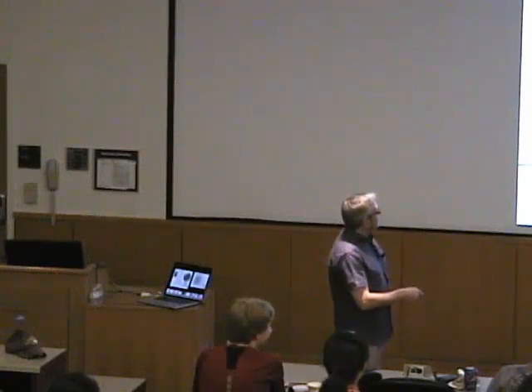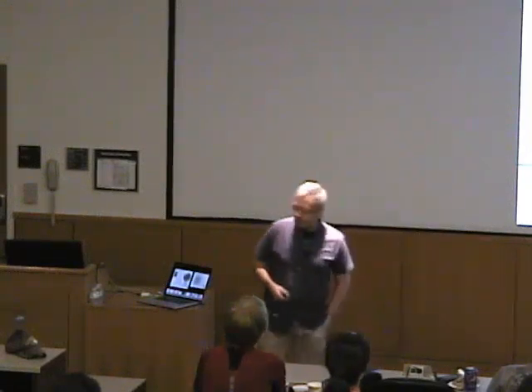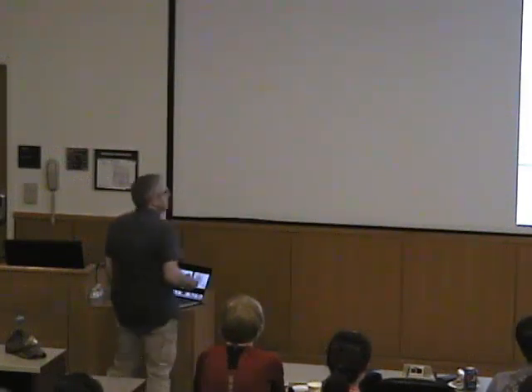Because everybody felt that a big deed had been done. And indeed, I guess that is kind of true. So we're back to these diffraction images. Now, what do they mean?